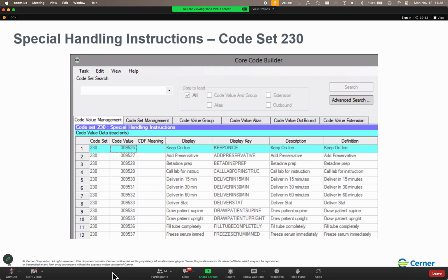And I don't know a lot about inspections, like the JCO auditors coming through and things like that, but I would think that you need to be able to open any accession number in order result viewer or accession result entry or MIC result entry, et cetera, et cetera, et cetera.